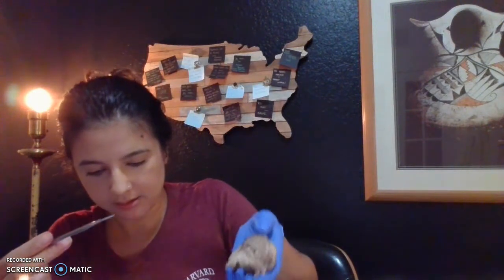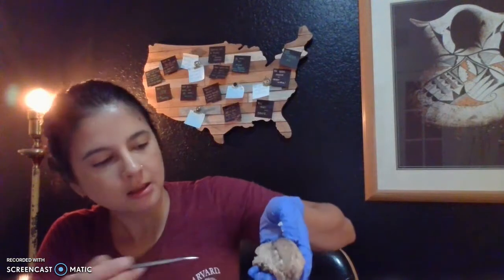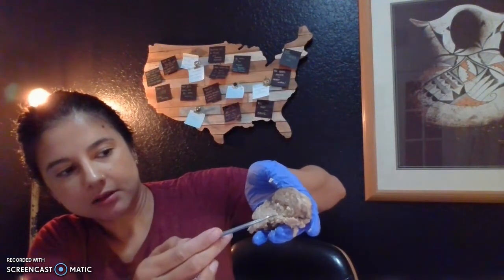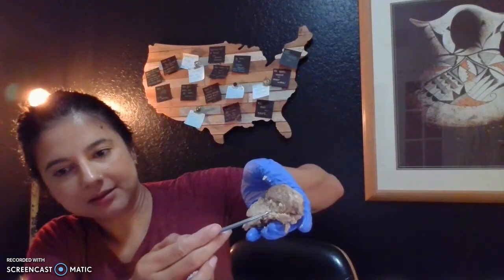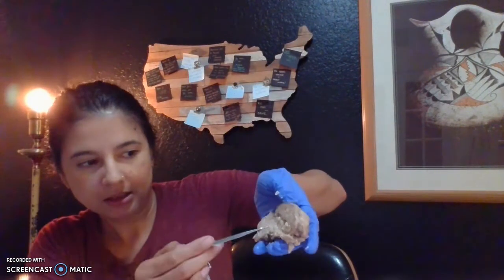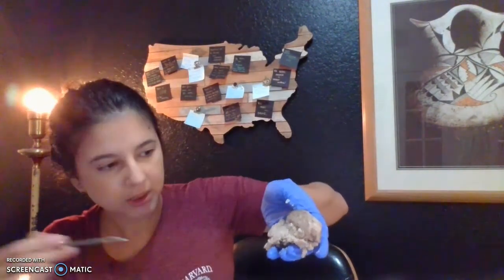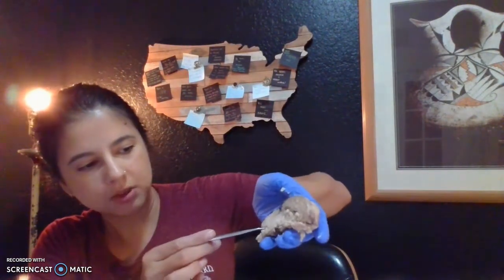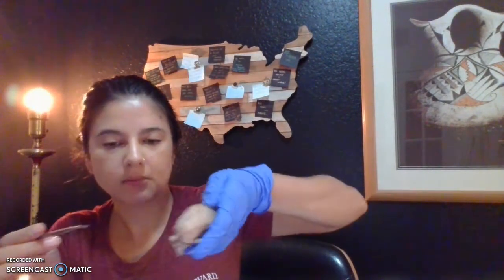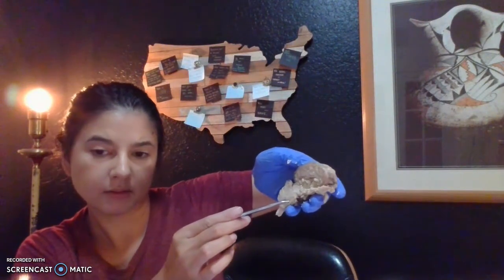And then the thalamus, and then the hypothalamus. This is really difficult to show. It's okay. Midbrain, medulla oblongata. Hopefully that was showing. I didn't check. Medulla oblongata.